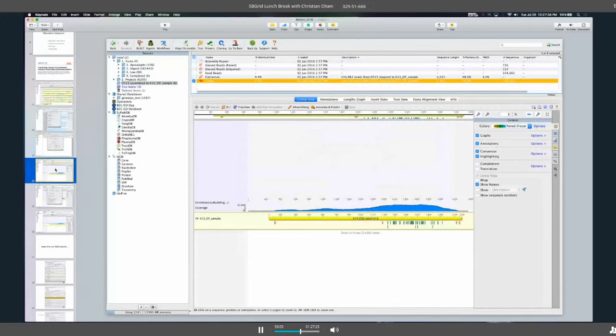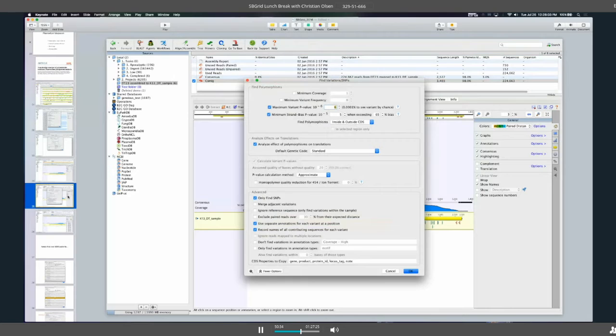When you do a reference mapping, you'll return a contig within Geneious. And you'll notice here in my sequence viewer, I've got my reads that I aligned to my reference sequence. All of my canonical SNPs are over there towards the 3' end in dark green. And you'll notice that you're not able to see the reads because you have to zoom in to see them. But this is what you normally get returned when you do this in a manual fashion.